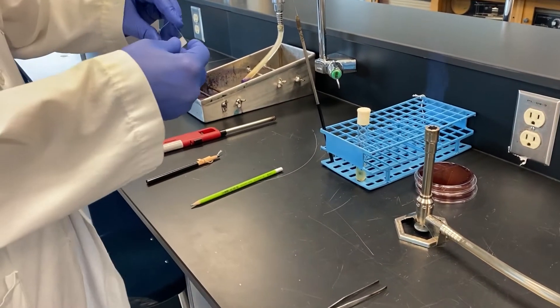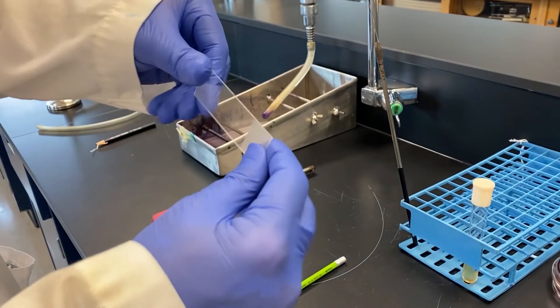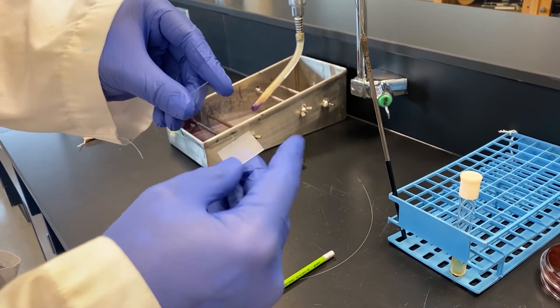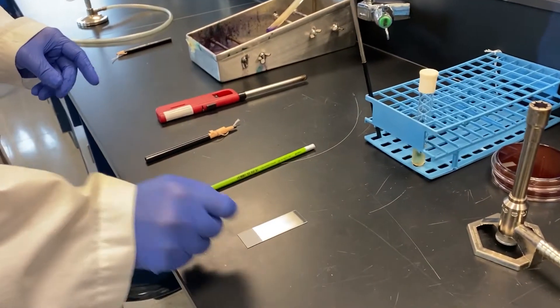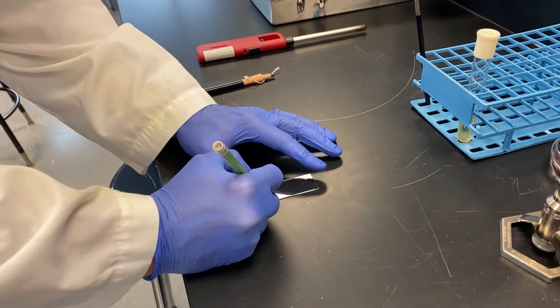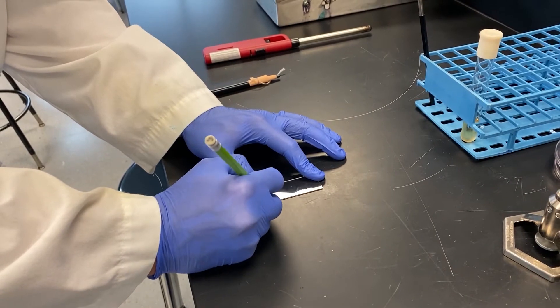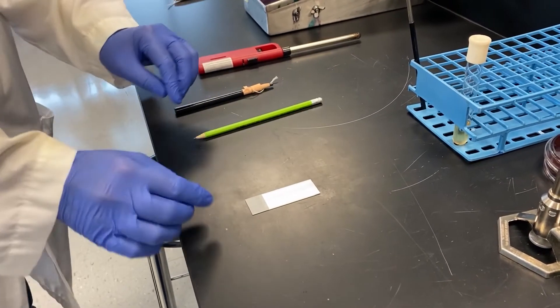The first thing you should do is label your slide. You'll need to identify the top and bottom of your slide. The top part feels rough. When labeling use a pencil not a permanent marker. Permanent marker can wash off during any staining procedures.